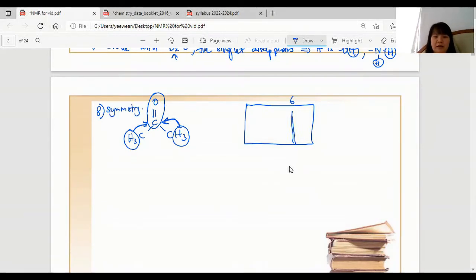You get a clue that it's symmetrical when you get numbers like 6 or 4. If you have 4, it's impossible to have 4 hydrogens on one carbon and still have something else going on. That would be 5 bonds, which is impossible. And 6, you can't have 6 protons on a carbon, so that is also not possible. So you get a clue when the number of occupants is more than 3.